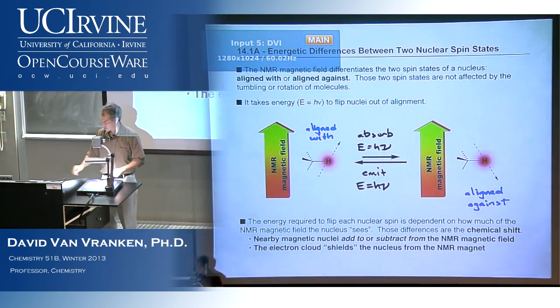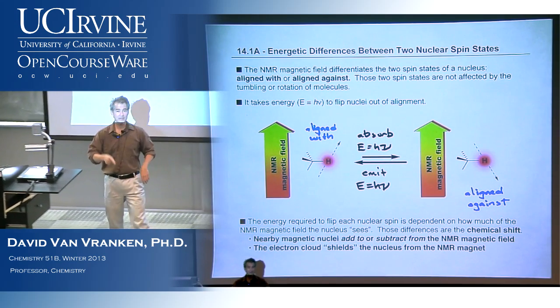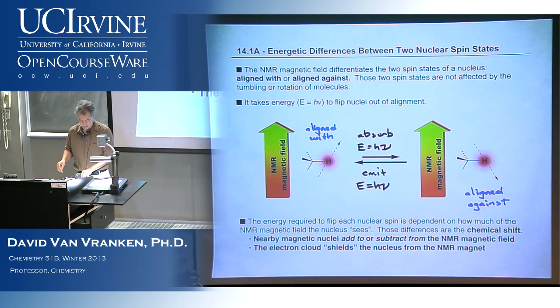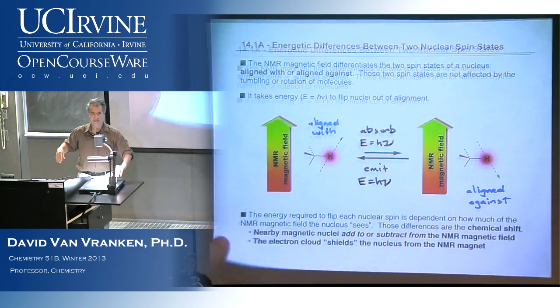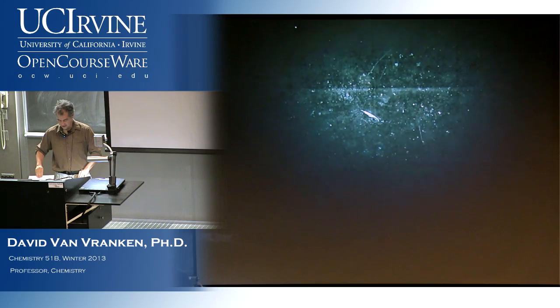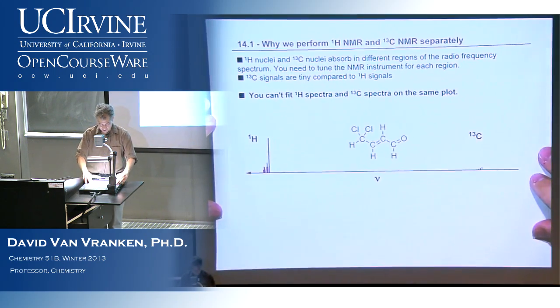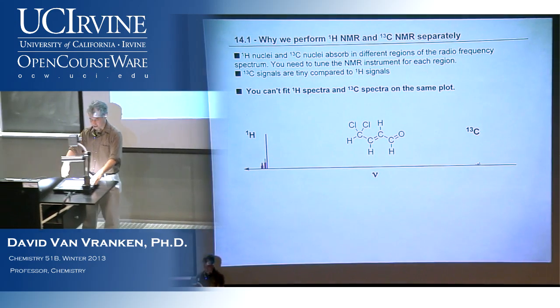We drop our tube in the spectrometer, we pulse it with energy, the spectrometer listens to the frequencies, and then it plots those frequencies for you. Yes, question? The sound that you have, the frequency is basically the same frequency as the one that you have in energy, right? Well, when you pulse with energy, you're pulsing every possible wavelength at the same time. You can't just pulse with one frequency. You pulse with this loud sound that's exciting every single possible frequency. And then the protons all start spontaneously emitting back their sound.